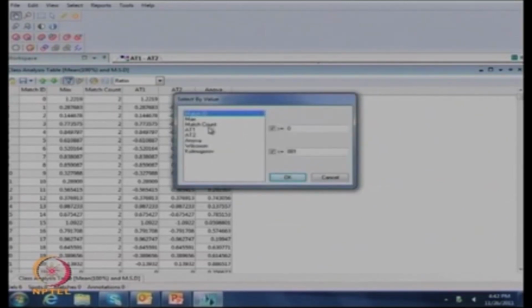Now what we are going to do is, first, for the ANOVA value, the maximum we are going to take is maybe 0.05 as the statistically significant value. So those many spots can be highlighted. Okay, right.